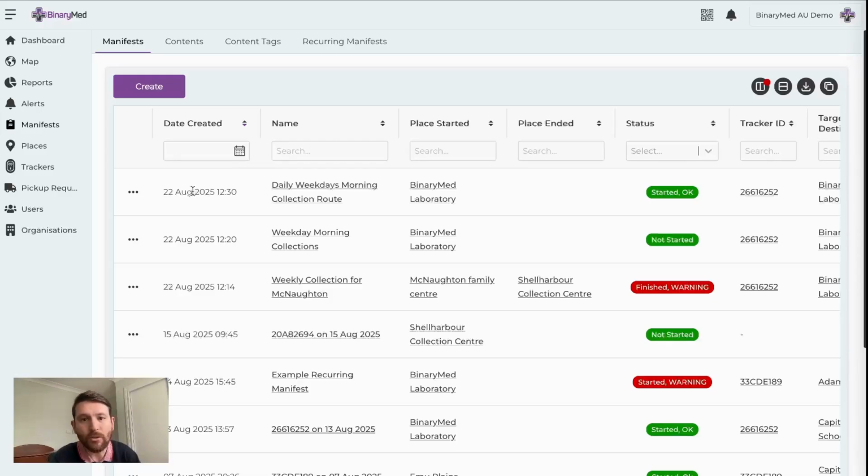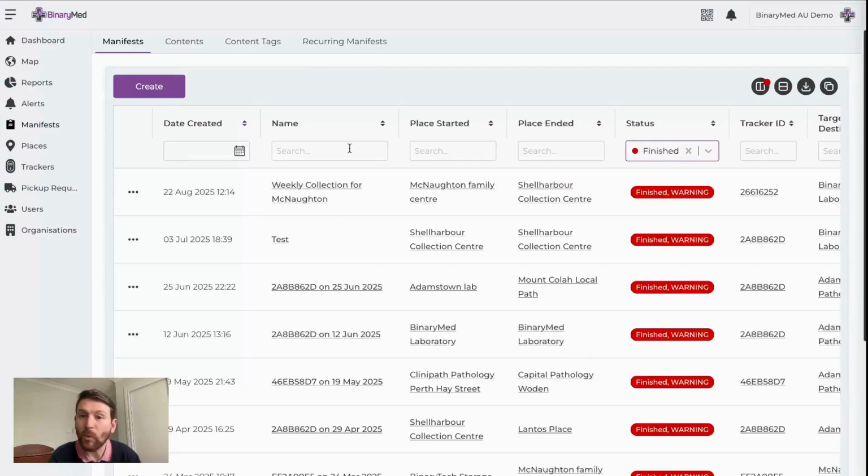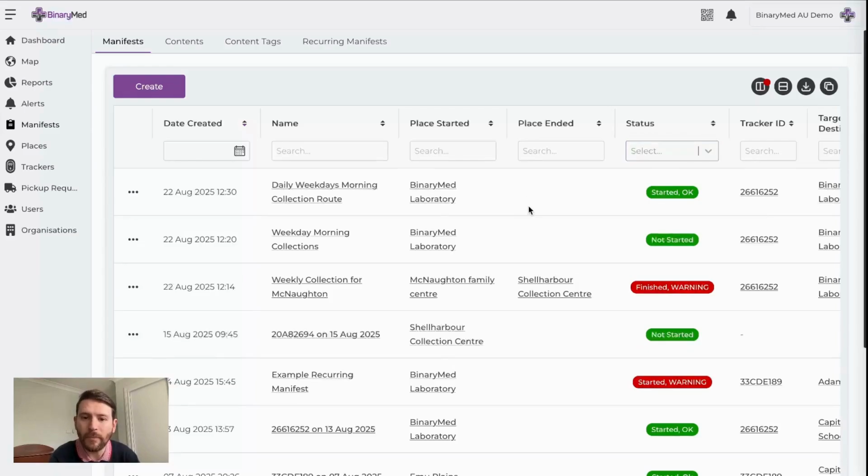And most importantly, during an audit, you've now got all of your non-conformance events happening in one location. We can go through and review these, report on them, record on them, however we need.